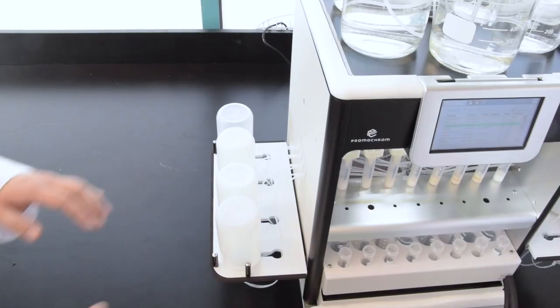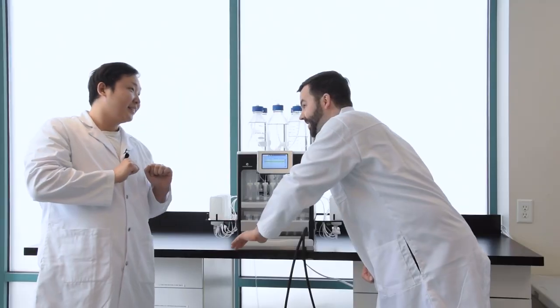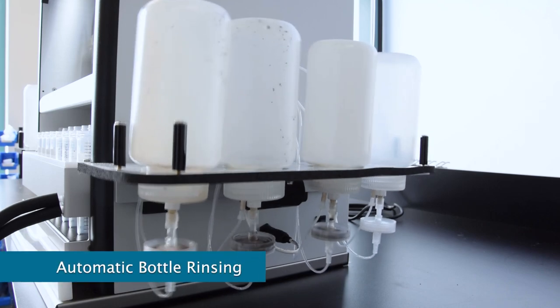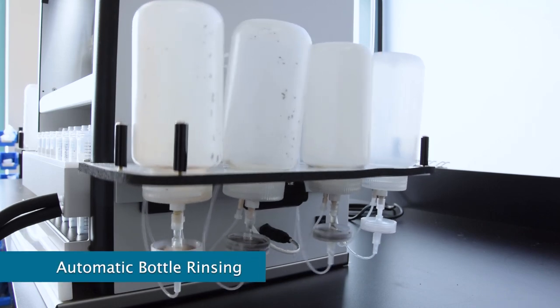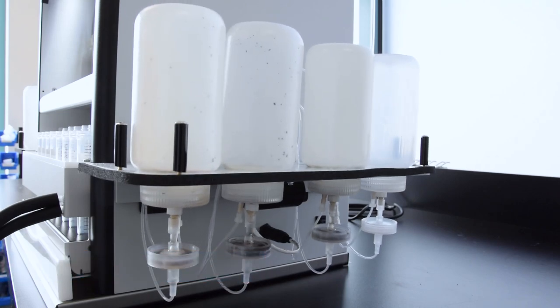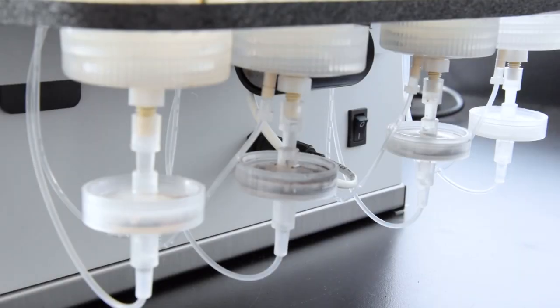What'd I miss? Oh look, all the samples are gone. I guess it's time to rinse the bottles. I got the left side. That won't be necessary. The configuration we have will automatically rinse the bottles, and even shake them to mimic manual rinsing. The goal is to have the full extraction performed without any supervision. This is quite a useful feature, especially because PFAS extractions involve multiple rinsing steps, and it's great to know that I don't have to babysit the system.